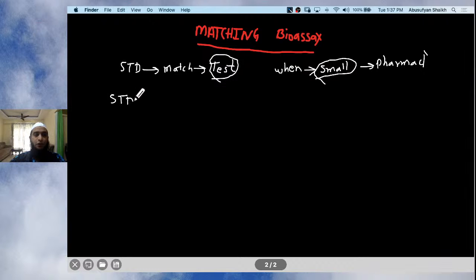Because it is required to check your tissue reproducibility, whether your tissue is reproducible or not, and whether it is sensitive or not, so that you will come to know with the different readings of your sample. So to check the tissue reproducibility and the tissue sensitivity, you perform the DRC, that is the dose response curve of the standard. So let's see how to perform it.